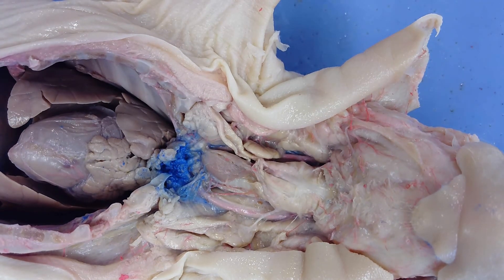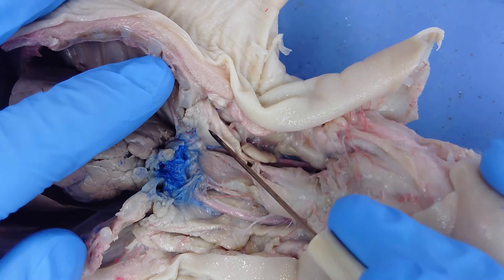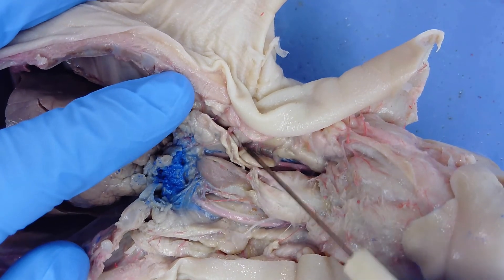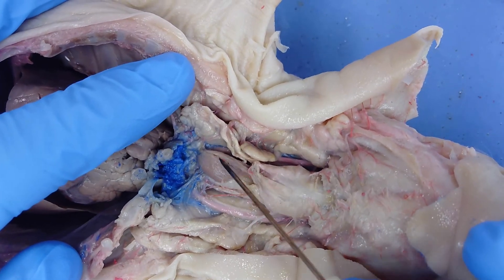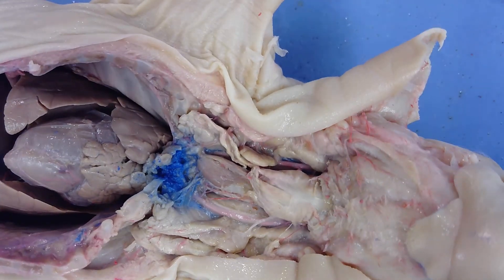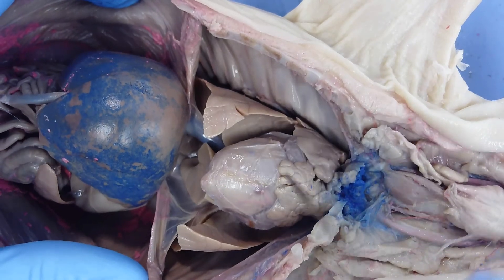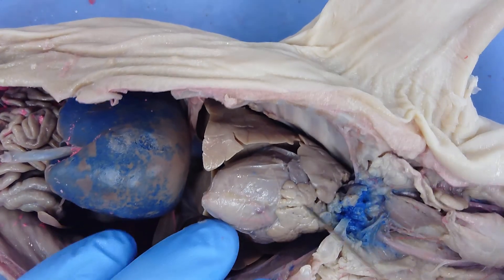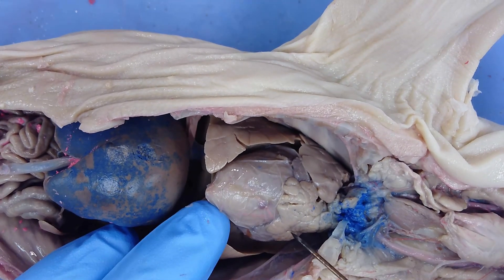There are a couple of other structures in the throat region. All this tan, fatty-looking material is called the thymus, which covers the structures here. There's also this dark brown structure, which is the thyroid gland. With the body cavity open, between the two lungs you have the heart, centrally located. It is a four-chambered heart with a right ventricle, right atrium, left atrium, and left ventricle.